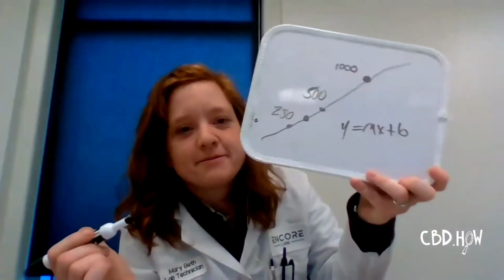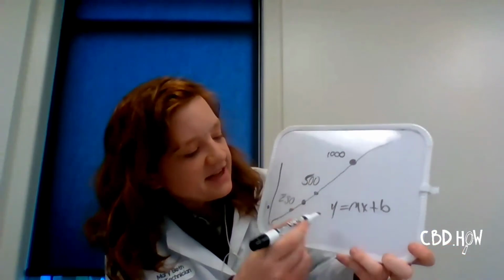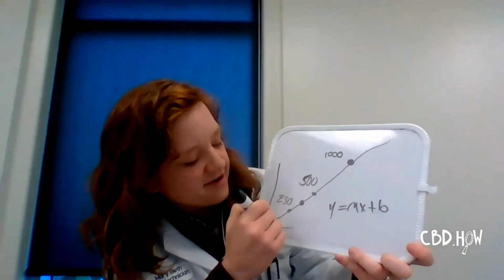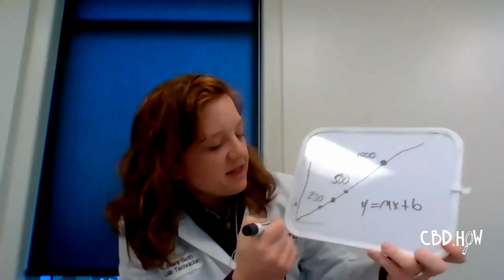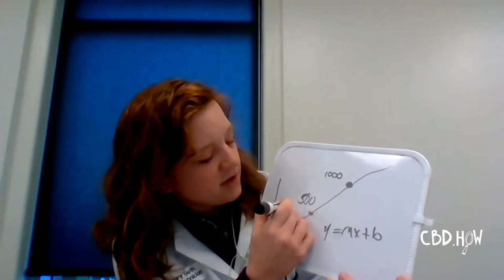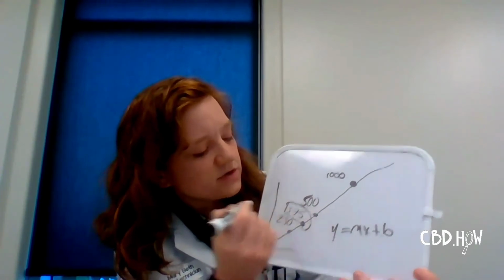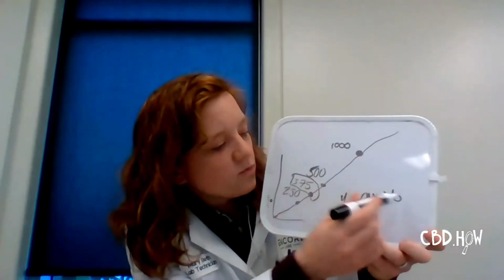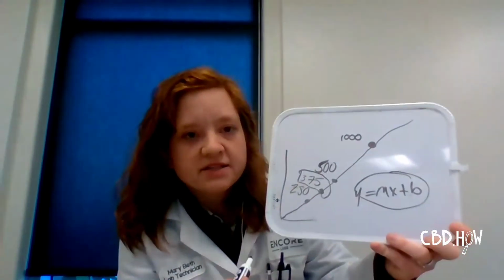I know there's a lot of people probably rolling their eyes, but you have a y point and an x point, and the y-intercept for us is typically close to 0. The slope of that line tells you this is, we'll say 375, because it's right in between those other 2 points. And we're able to determine that based on an equation that the instrument makes.